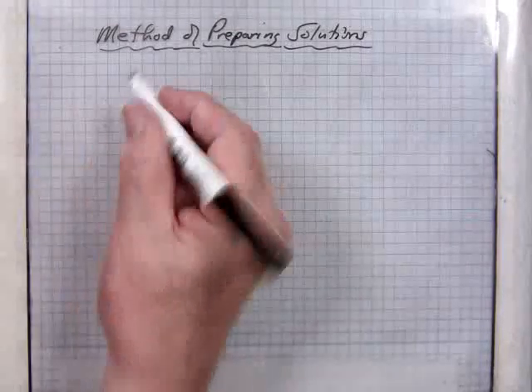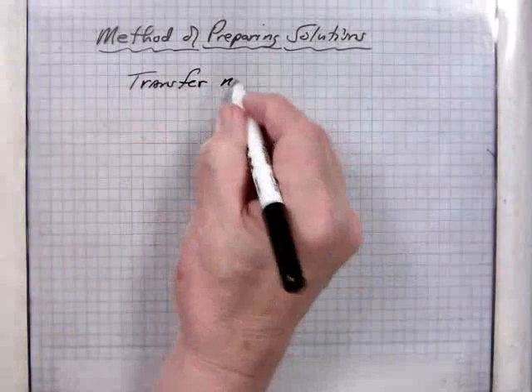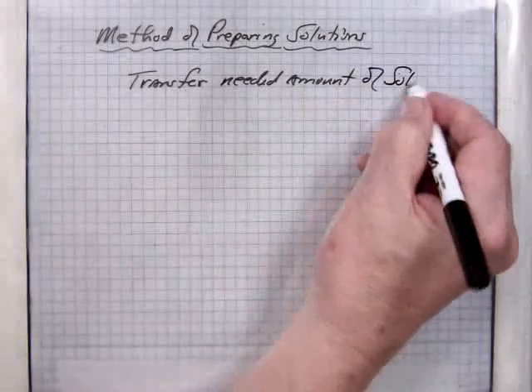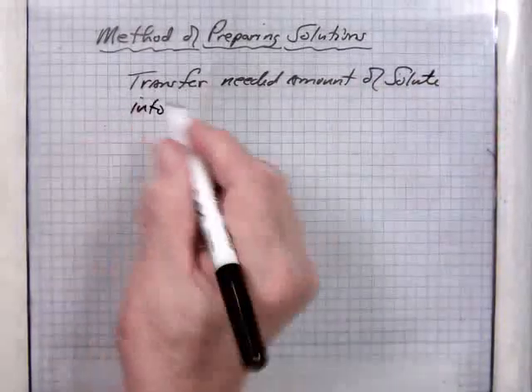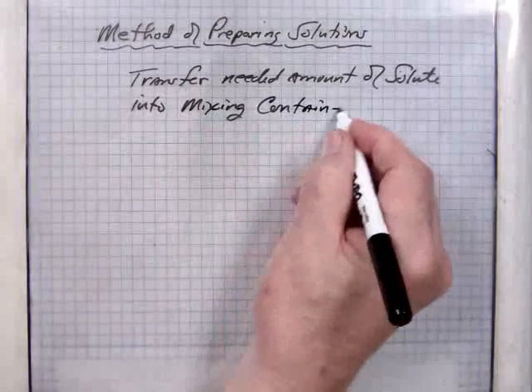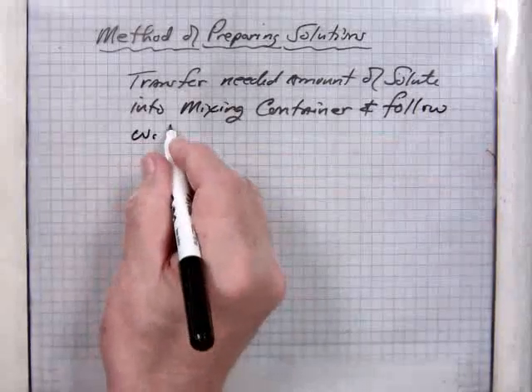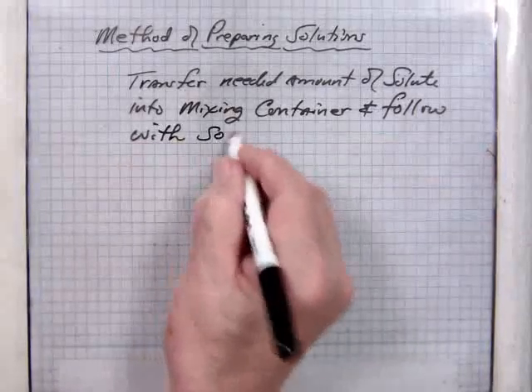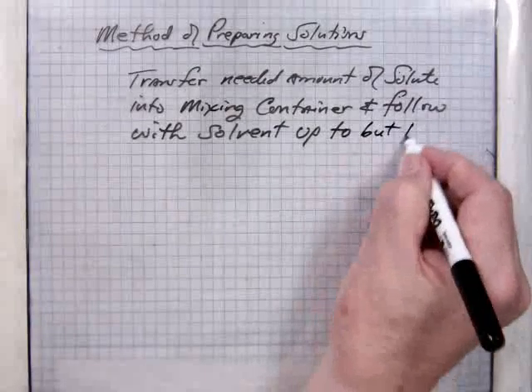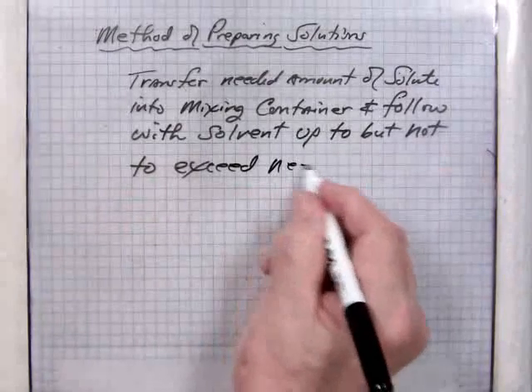Now, of course, the idea is to transfer needed amount of solute into mixing container and follow with solvent up to, but not to exceed, needed total volume.